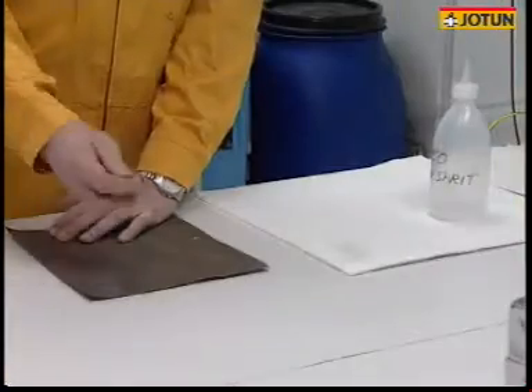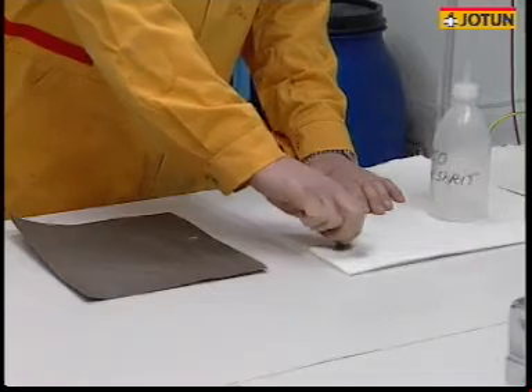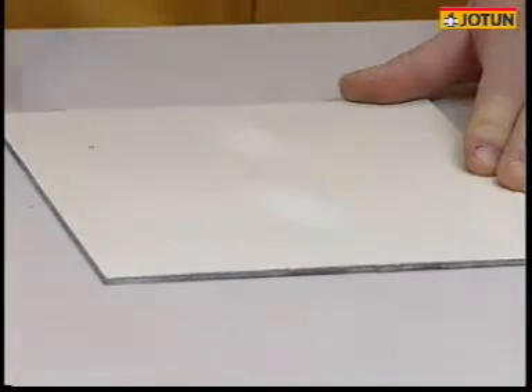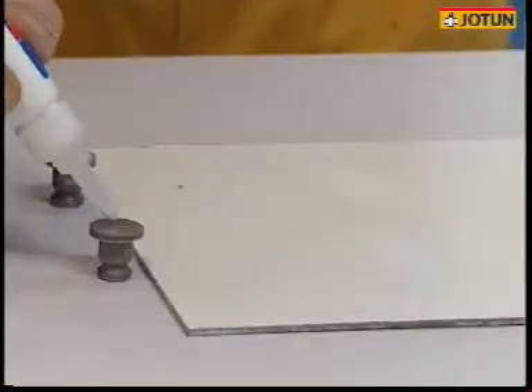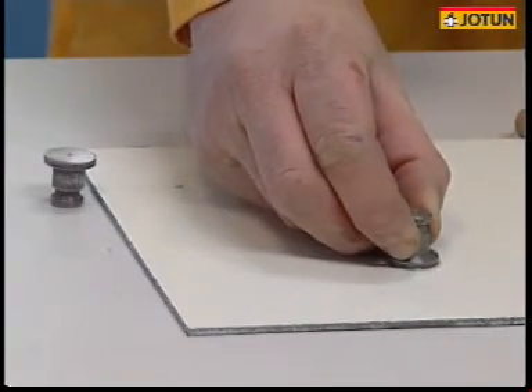Start the testing by grinding and cleaning the dolly thoroughly. It's advisable to rub the paint to remove inactive layers and to improve adhesion to the dolly. Remove the dust before gluing the dolly to the painted surface. Make sure you use the correct type of glue and let it cure for as long as required.